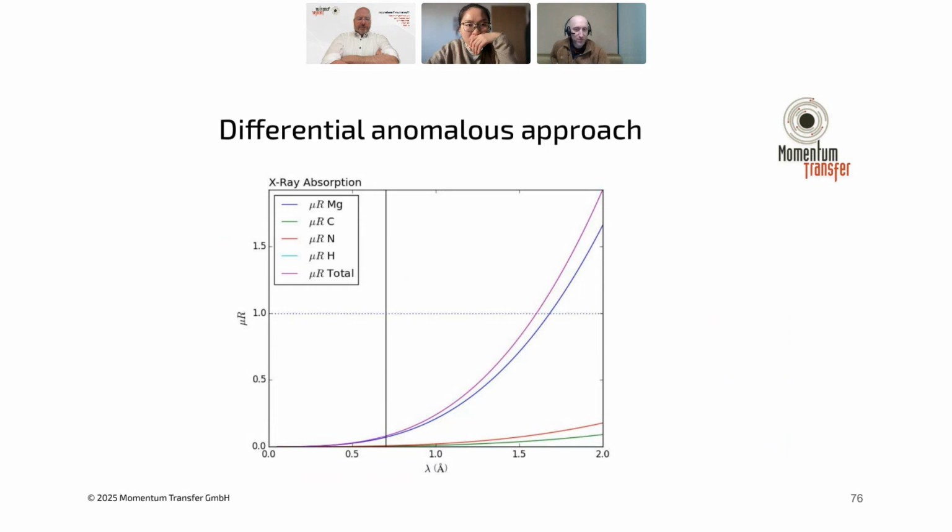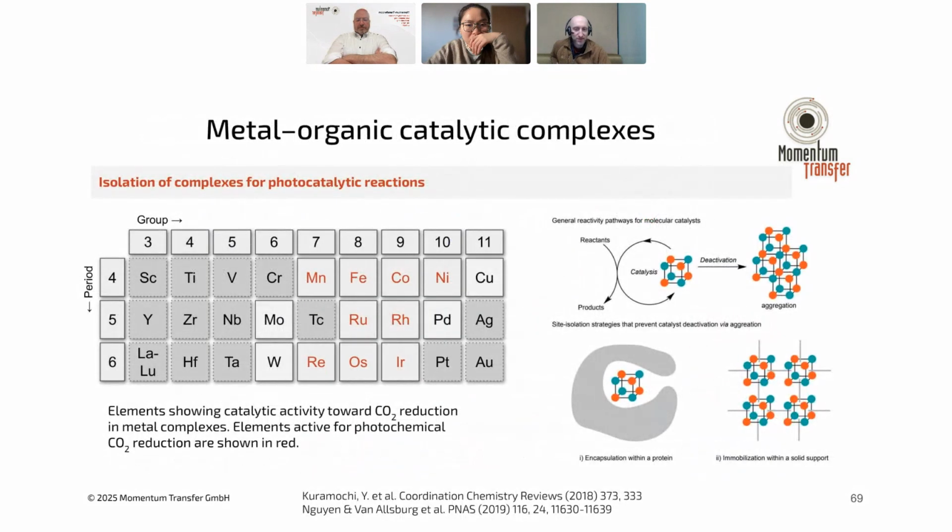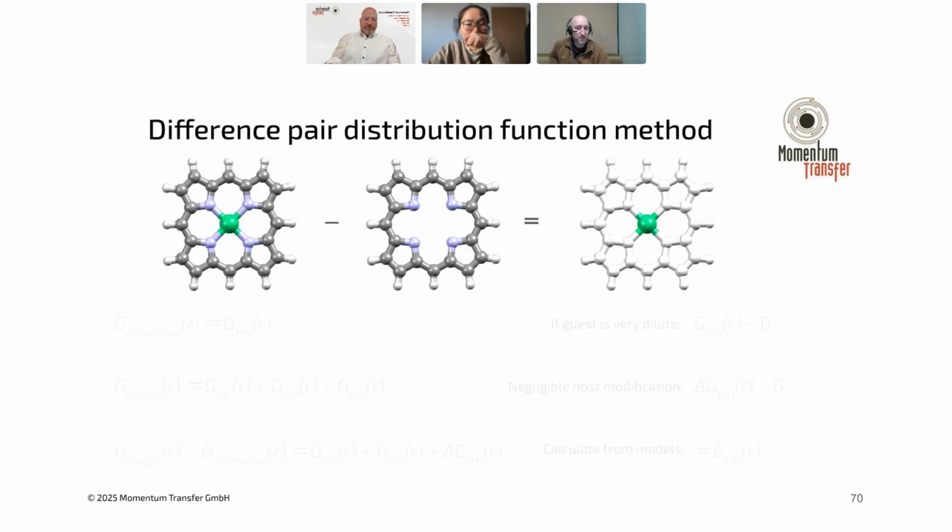And so if we go back to looking here, the K edge, for instance, for manganese to copper is in the range of 7 or 8 keV. Molybdenum to palladium, I think, is on the order of 20 to 22 keV. And tungsten to iridium is around 74, 75 keV. So for the 4d and 5d metals, you're in energy ranges where you can potentially do PDF measurements, but for the 3d metals, you don't really have a convenient way to do PDF measurements on them.